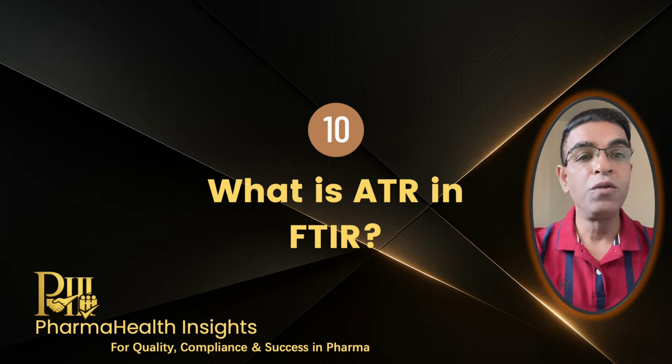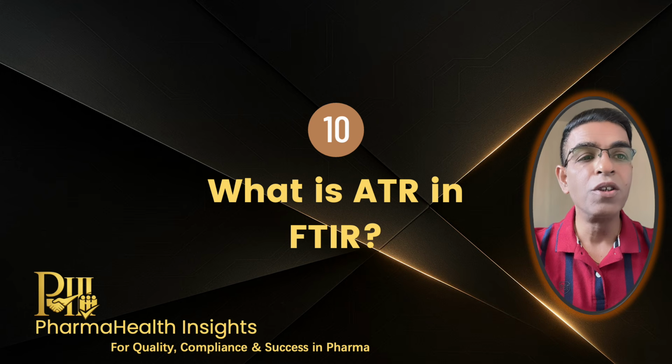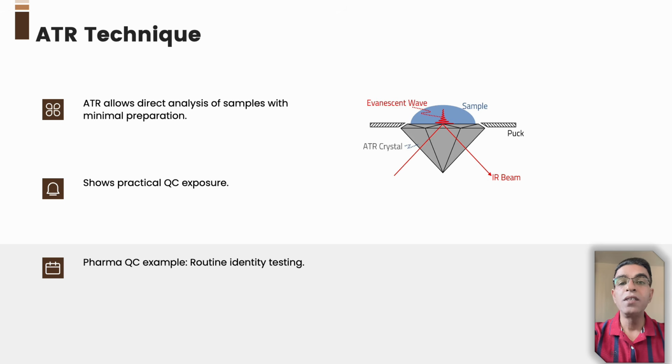So now that you have told about the sample preparation techniques mentioning the ATR, now the interviewer will specifically ask about the ATR. So, what is ATR in FTIR? And you can answer very smoothly like this. Sir, ATR stands for attenuated total reflectance. In this technique, instead of making pellets or doing complex preparations, we simply place the sample directly on an ATR crystal. The infrared radiation interacts mainly with the surface of the sample and we get the spectrum.